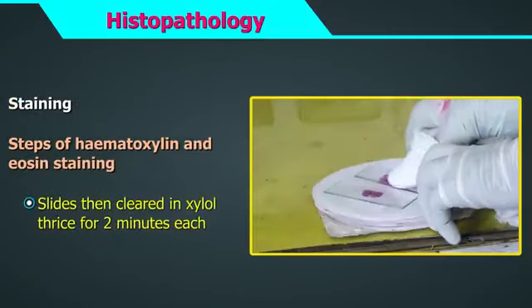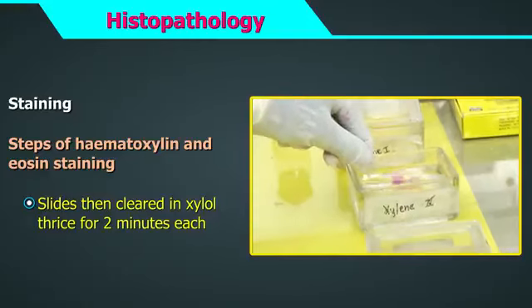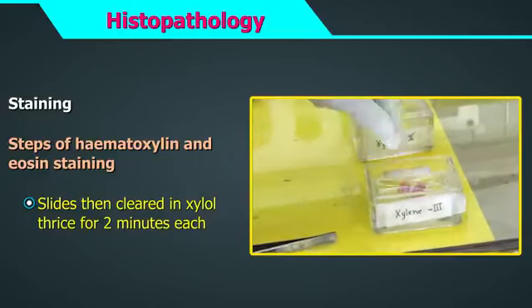The slides then need to be cleared in xylol. This is done thrice for 2 minutes each. Gently wipe the back of the slide and around the tissue section after each change.